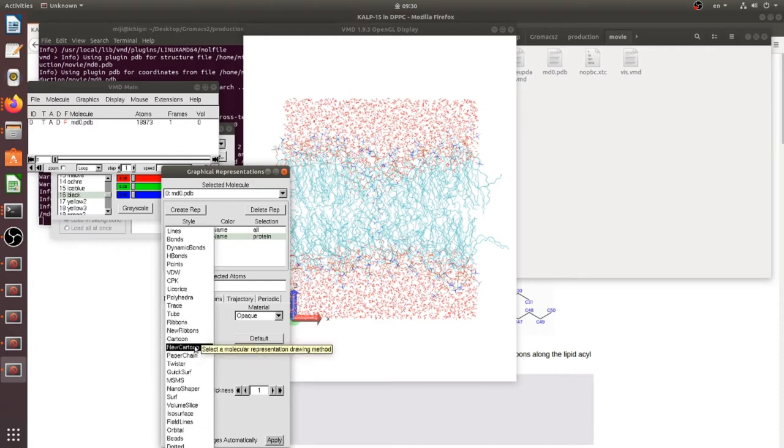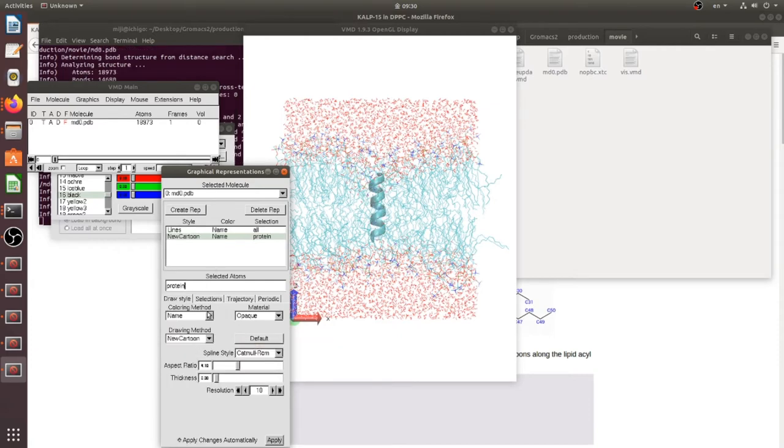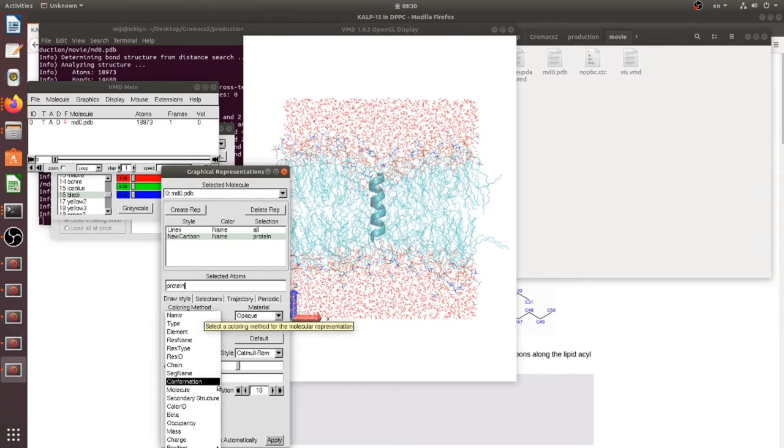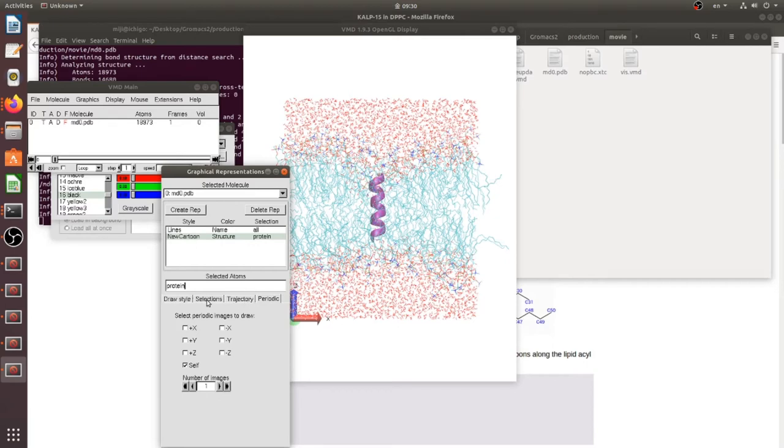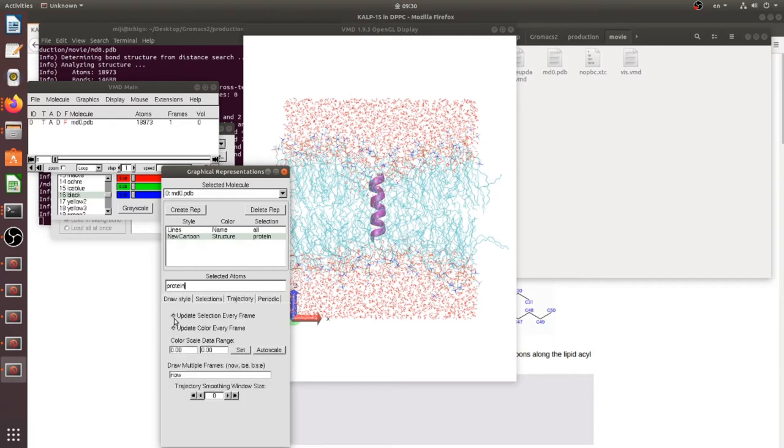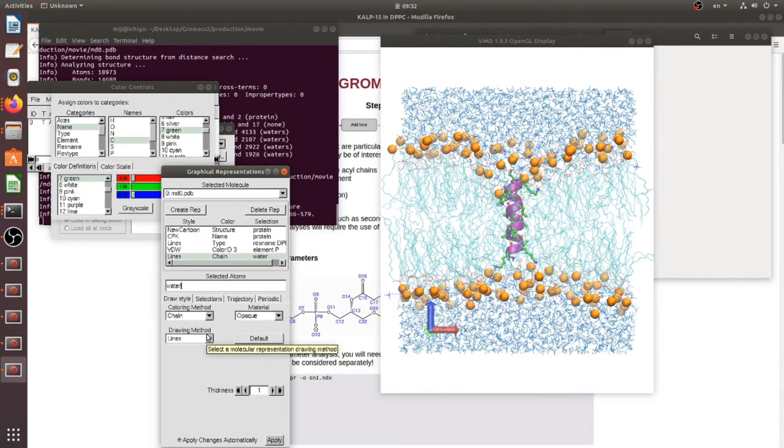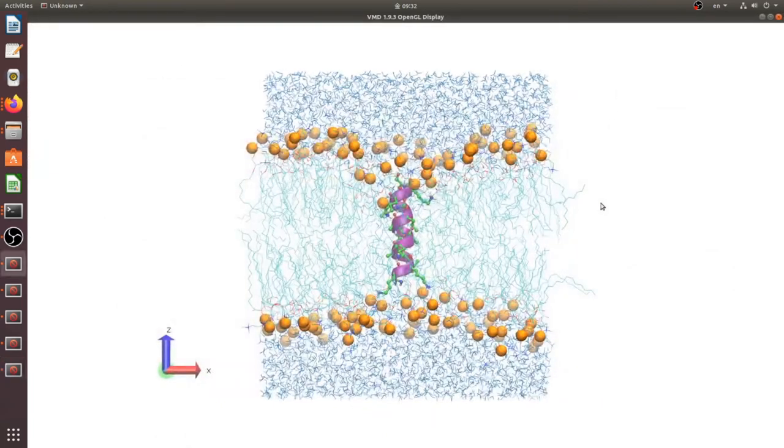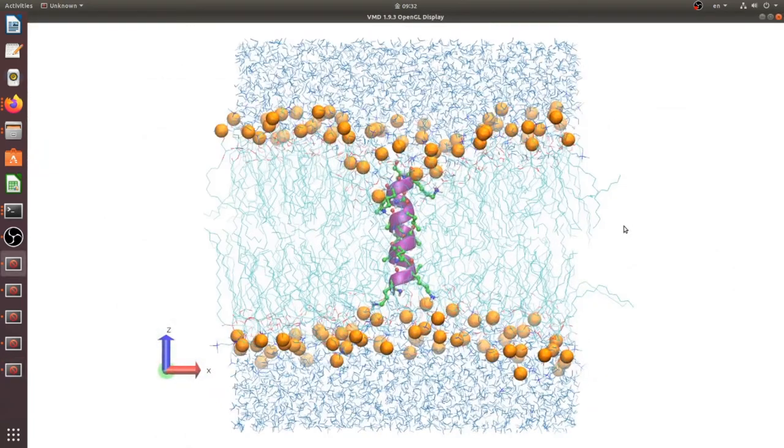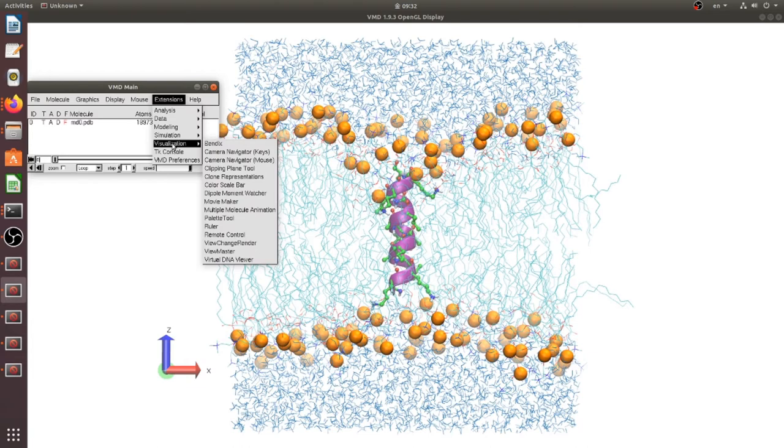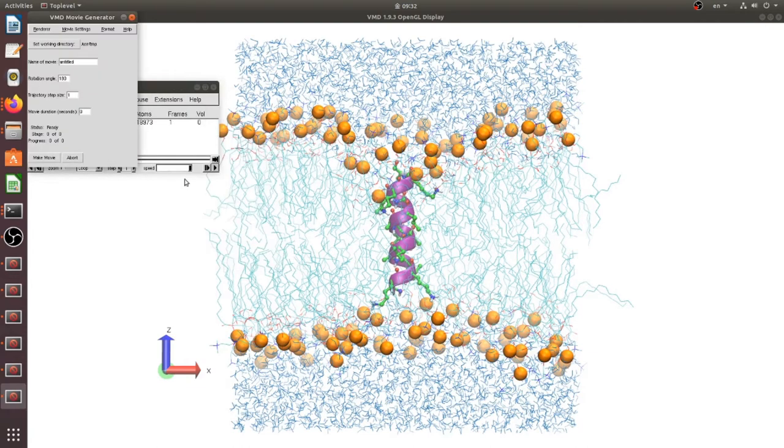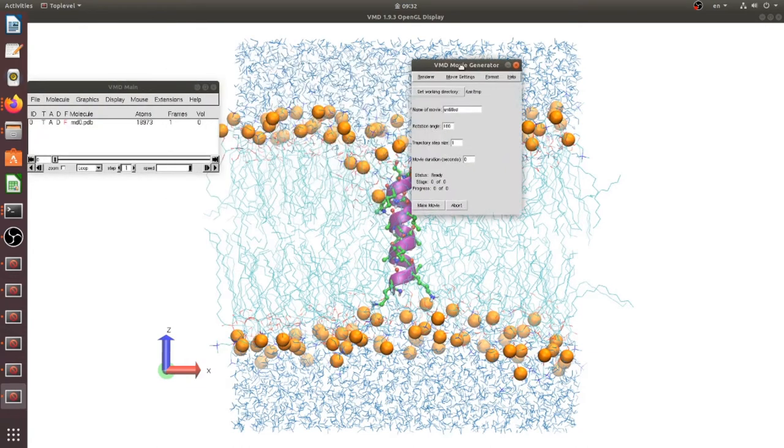New cartoon, secondary structure, trajectory update every frame, color also okay. Now we should open visualization and make movie maker.